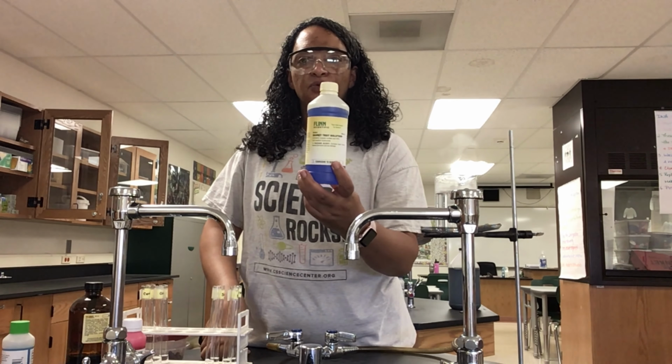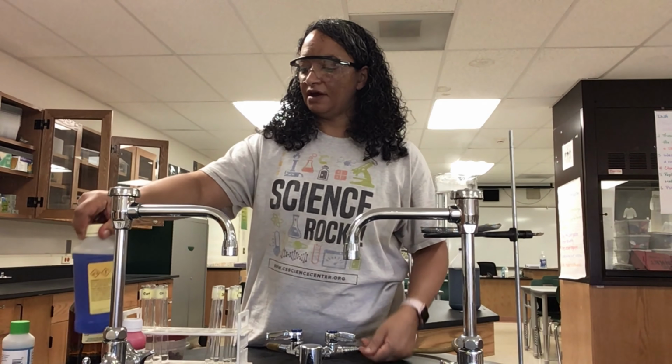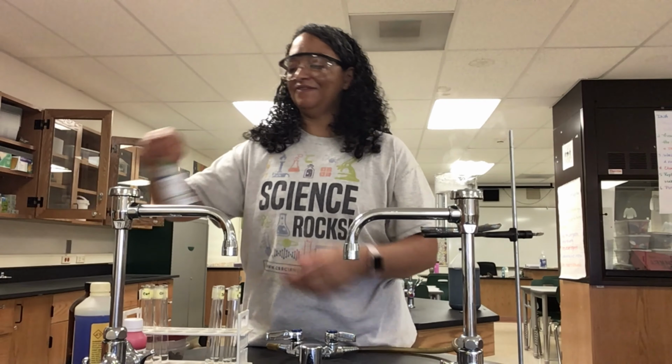We then have Biuret, which I may be saying wrong, but it is an indicator to say whether there are proteins. I had to remember. And then we're using Benedict's solution, which tests for simple sugars.